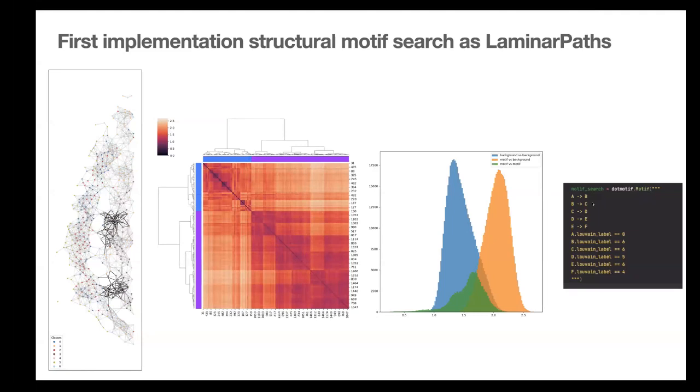So you can make a query, and it goes through the whole graph structure and finds motifs, or in this case just paths, which satisfy this. That's what I did here. I wrote a tiny query, and it found these two neighborhoods here.